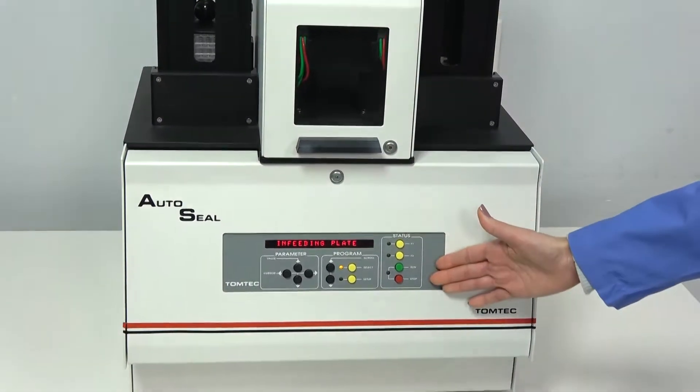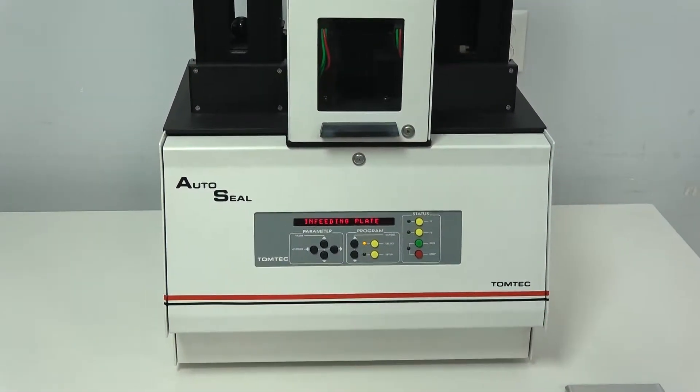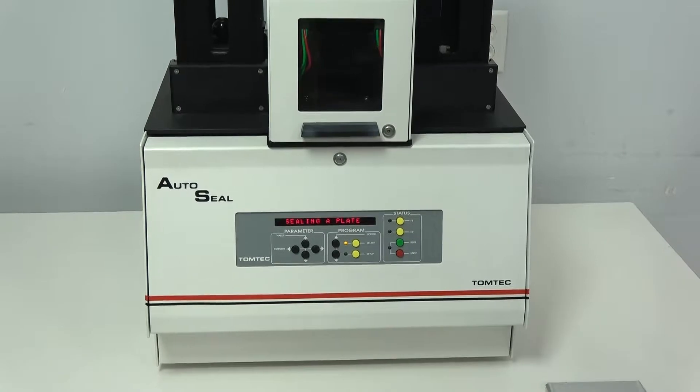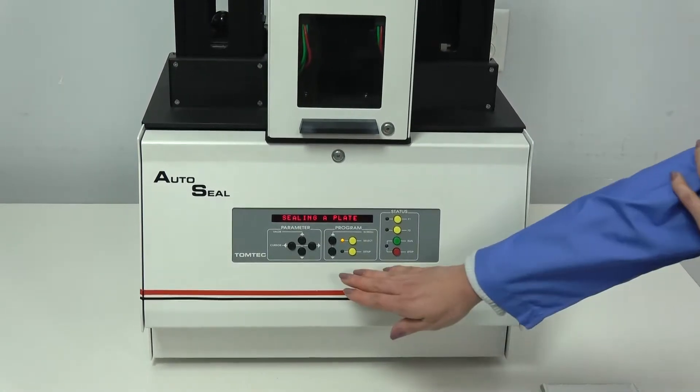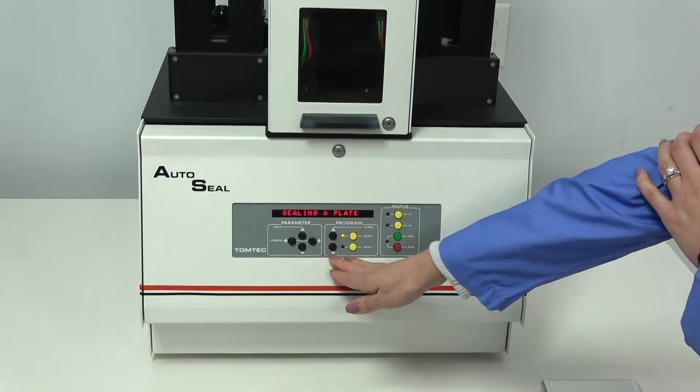On the front here you have 12 programmable settings. These are time temperature sequences that you can create a custom label for and find with the toggles located here.